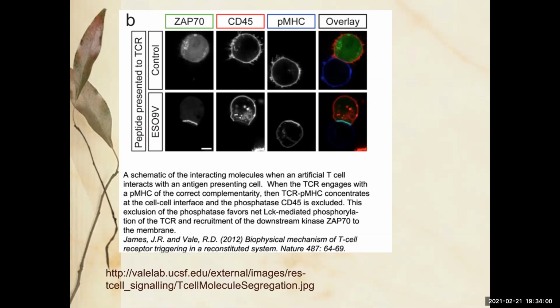And so when you're doing fluorescence microscopy, color is really important. Color is your signal, you might think, right? Because our eyes see color and we react to it, we get all happy. But your signal, in truth, is just the fact that there is something coming from that part of your specimen. Because the point of fluorescence microscopy is that it's very specific, and you can have a lot of specimen and only part of it will react when you shine light on it.